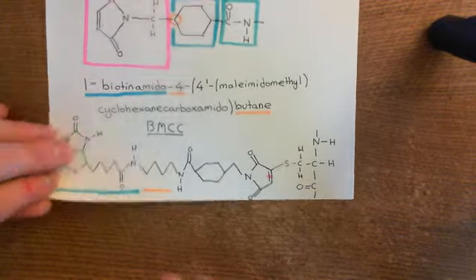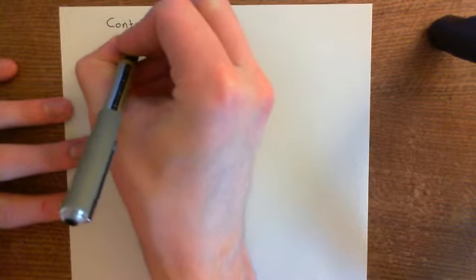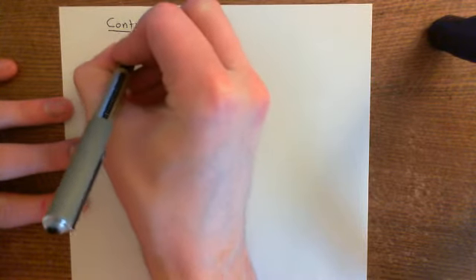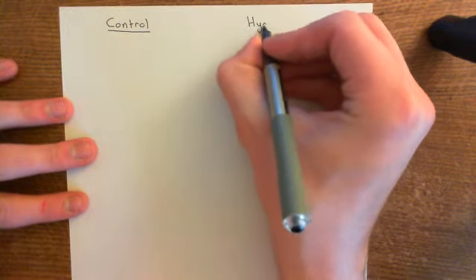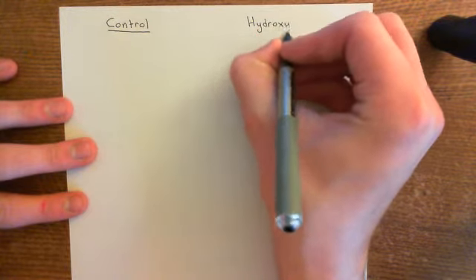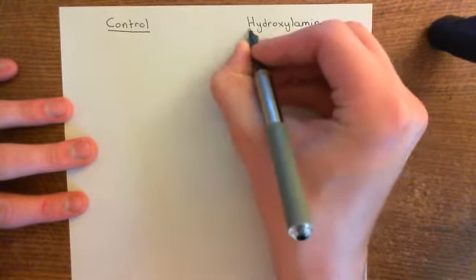So let's have an update on what has happened to our proteins A, B, and C. We'll draw the state of these proteins in the control, and also the state of them in the test tube that we have added hydroxylamine to. We've now added our BMCC molecule.